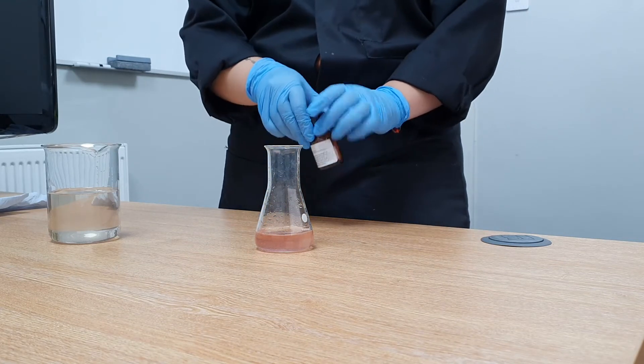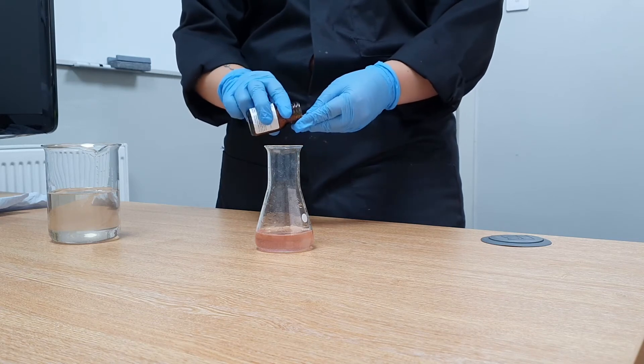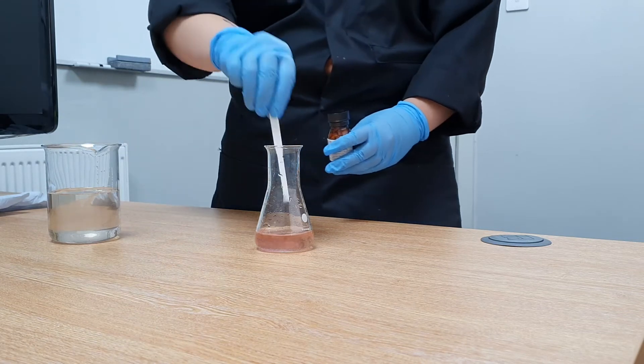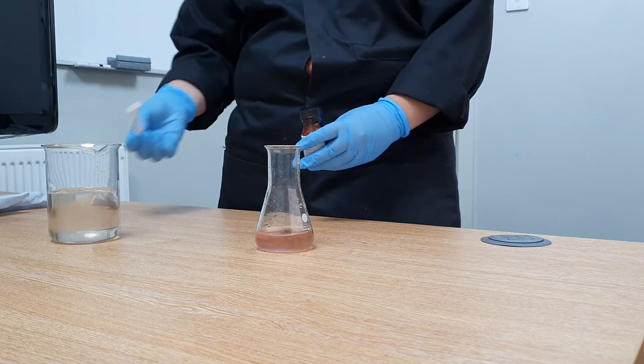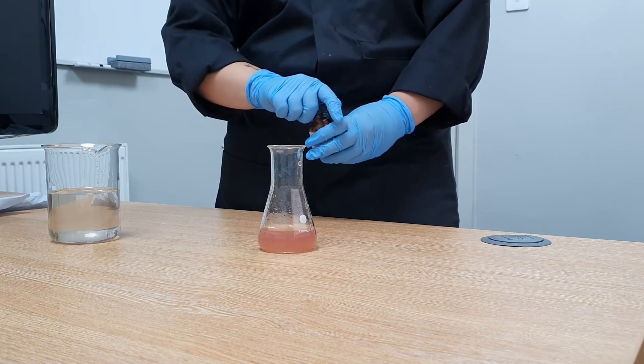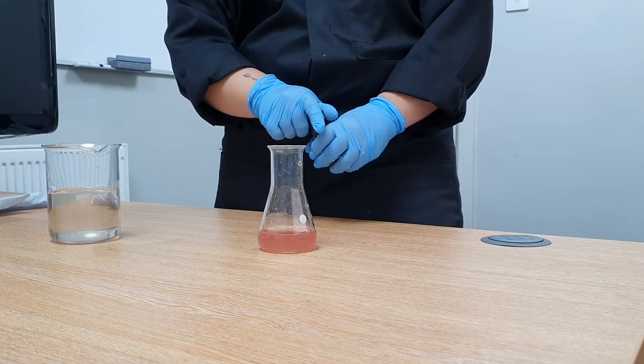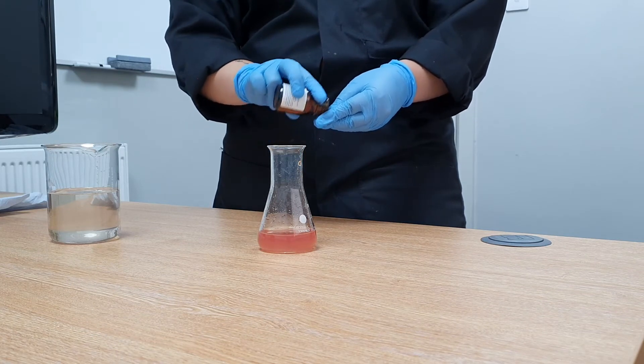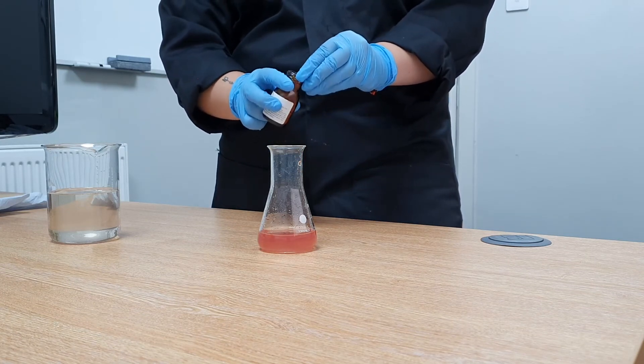Add a second yes no hardness tablet. If the red colour persists the total hardness is greater than 20 mg per litre. Continue to add tablets to the 20 ml of sample until a green colour is given.